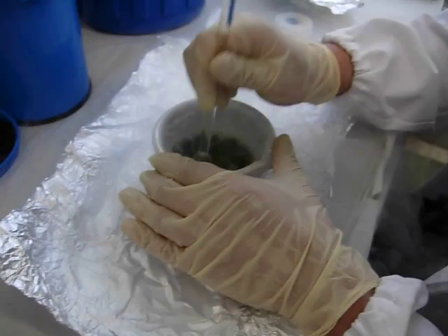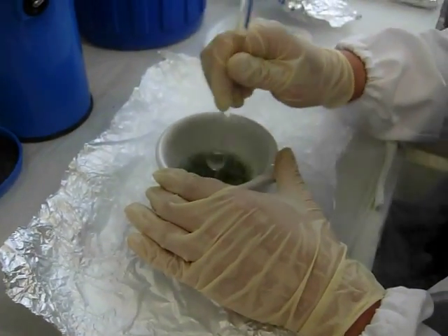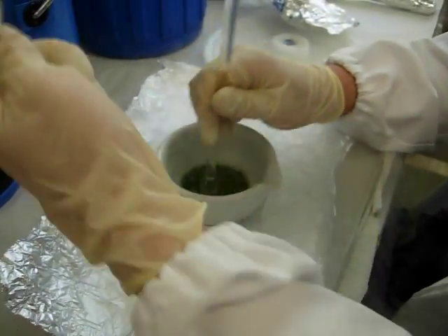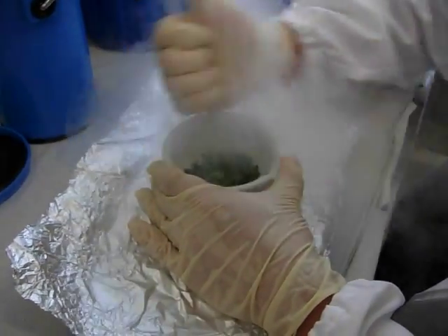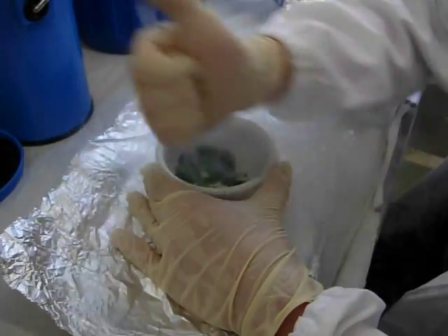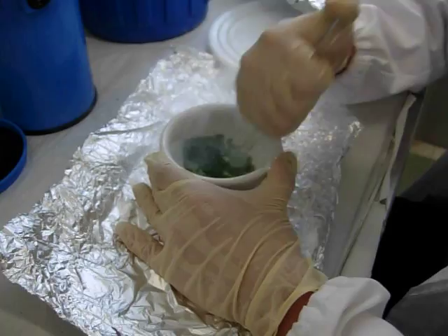If the material is heavily ground, I can repeat the process — I can add more and crush more. I just have to powder it as much as I can.